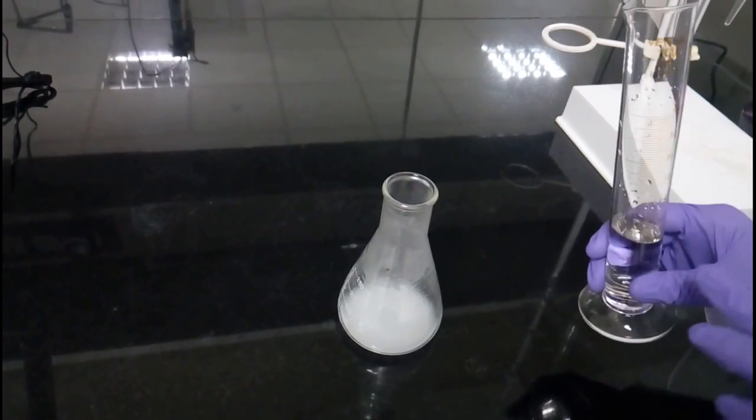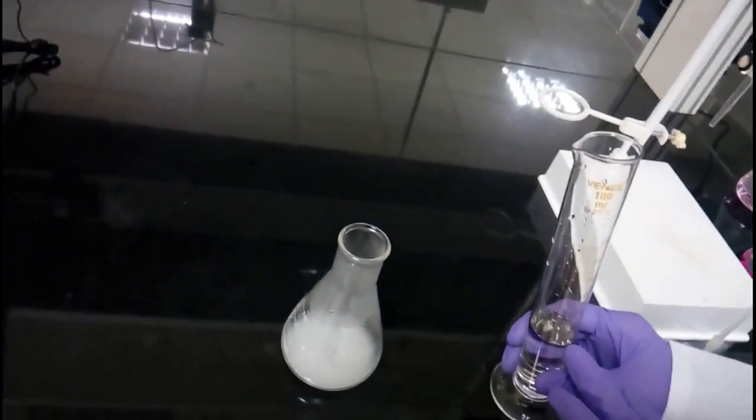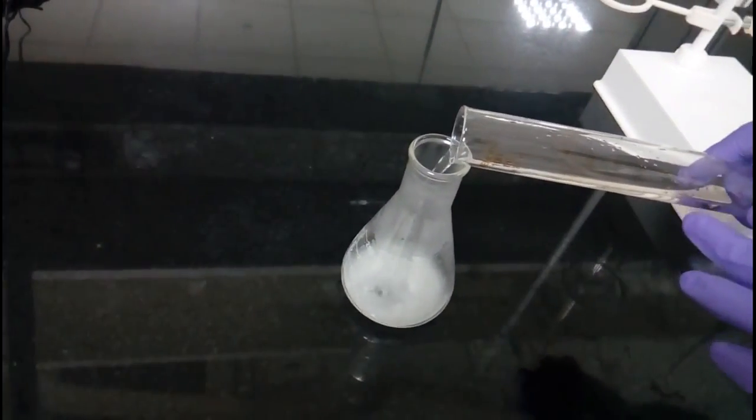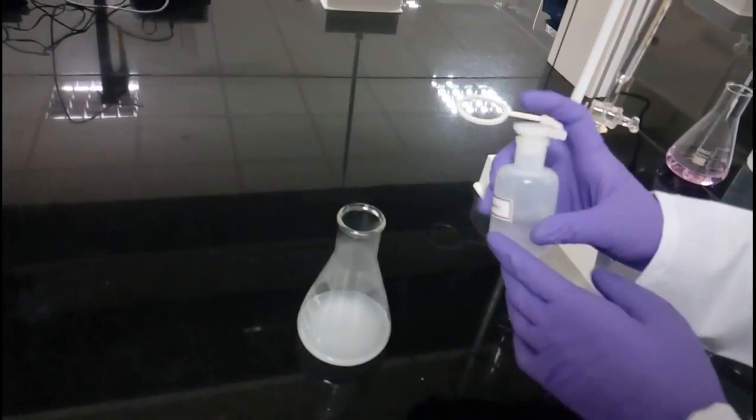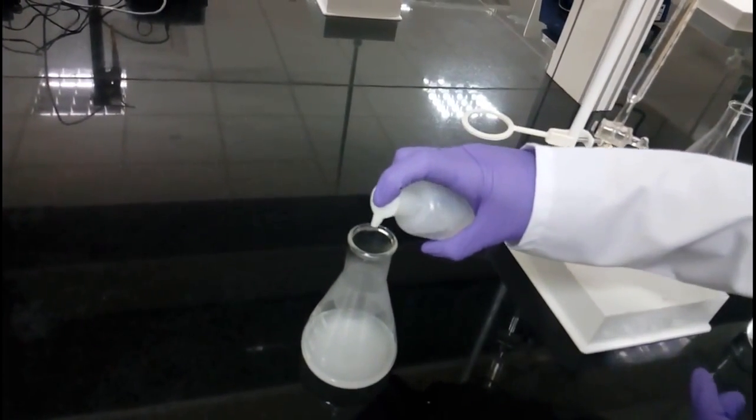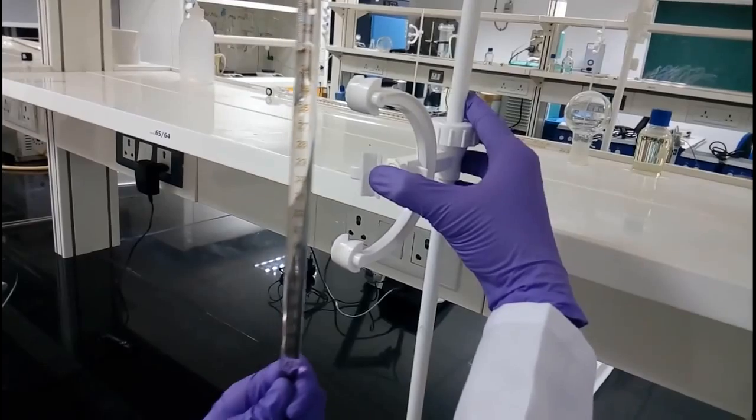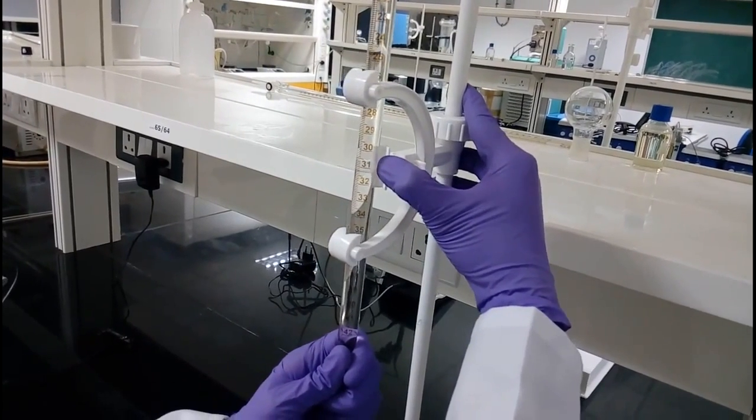Add 40 ml of distilled water to the conical flask using a measuring cylinder. Add 6 drops of phenolphthalein indicator to the conical flask. Clamp the burette to the stand.